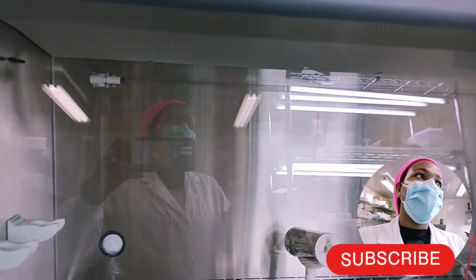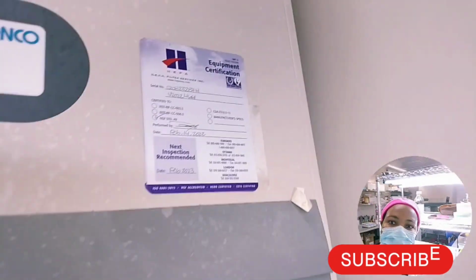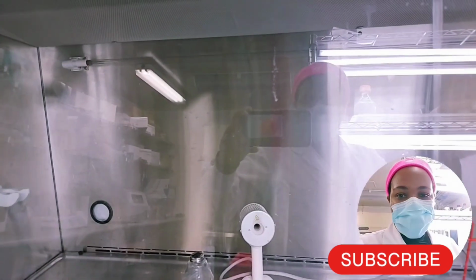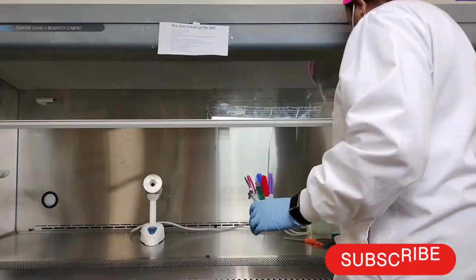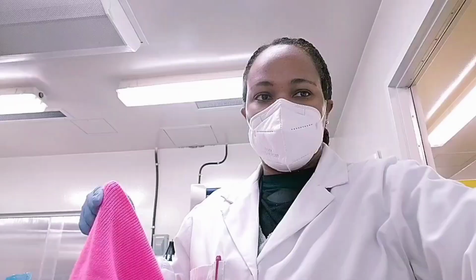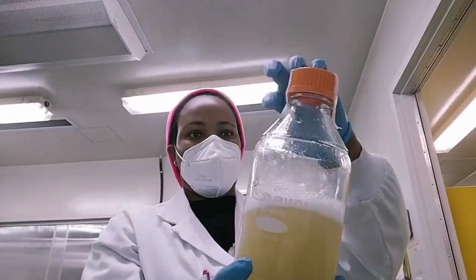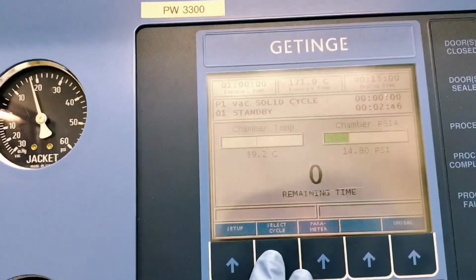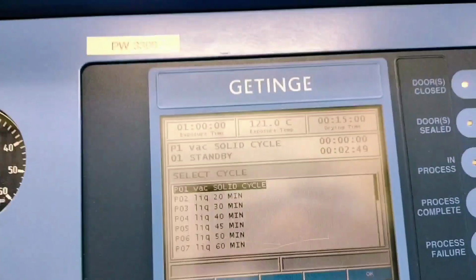So I'm going to empty the BSC and then leave it empty until a technician checks the HEPA filter and ensures that everything is okay for the certification, and then I'll come back and get it ready to work in. I'm going to go sterilize the medium, that's a sugar-rich one, and while I'm doing that, I'm going to load and sterilize the BSC in the meantime. I'm going to change the cycle to liquid.